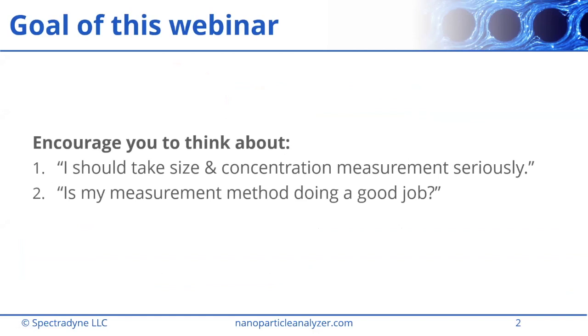My goals for this webinar are twofold. First is to encourage you to think about the importance of measuring size and concentration of the particles in your samples. This is a serious question, and I hope to convince you of that at the beginning of the talk. And then we'll spend time asking you to think about whether your measurement is doing a good job, whether the measurement method that you're using is working properly and operating within the bounds that it's supposed to be.